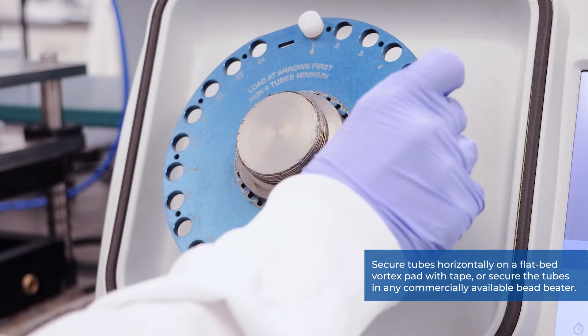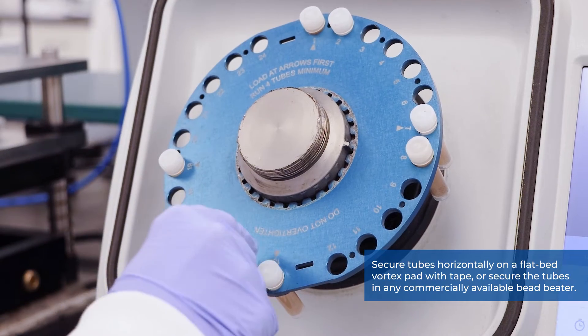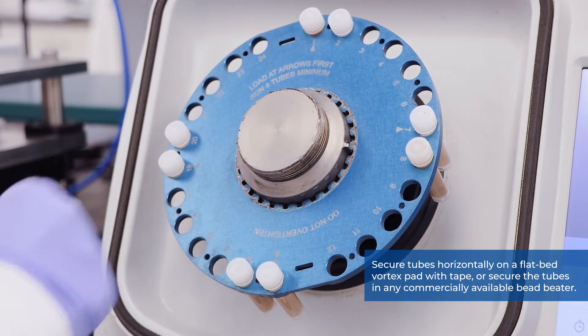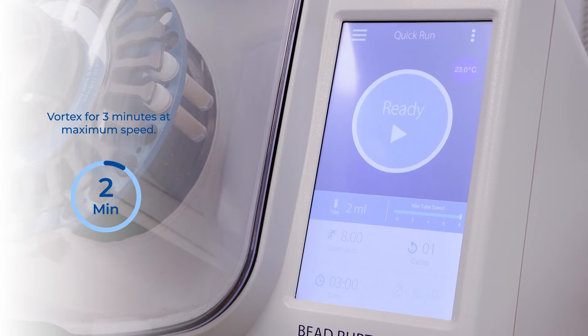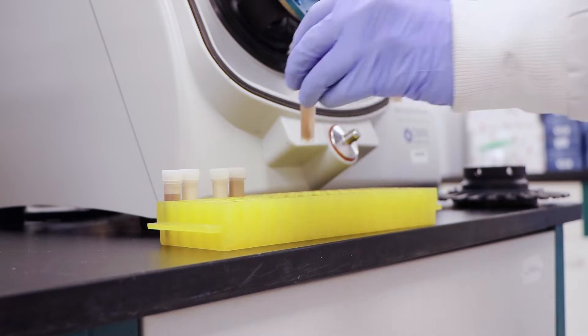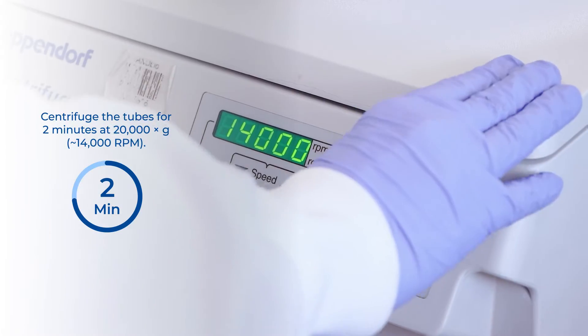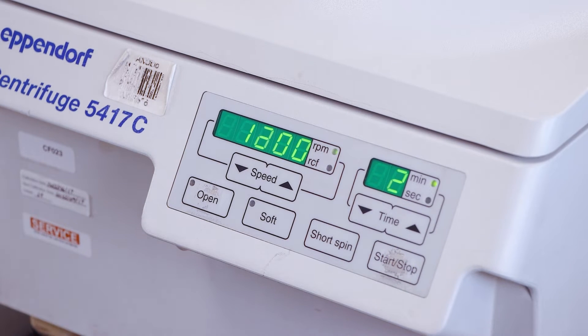Secure tubes horizontally on a flatbed vortex pad with tape, or secure the tubes in any commercially available bead beater equipment. Vortex for three minutes at maximum speed, then centrifuge for two minutes at 20,000 G or 14,000 RPM.